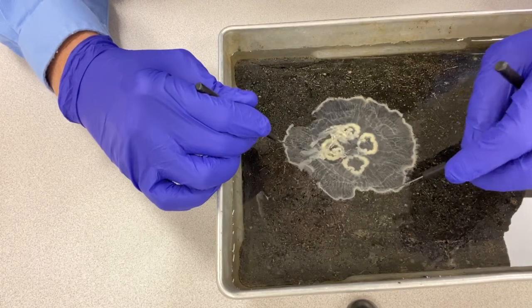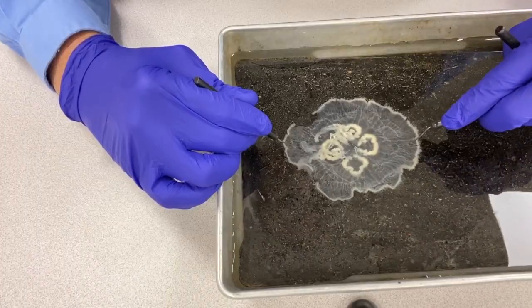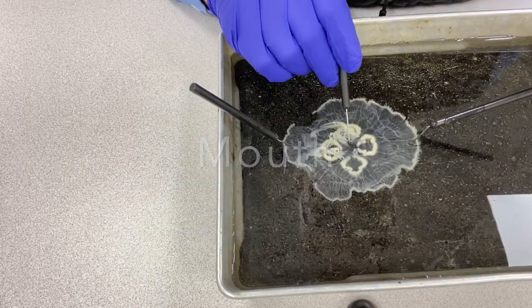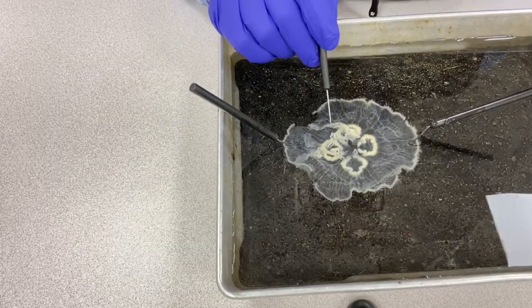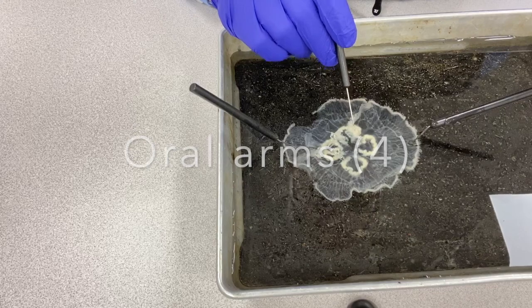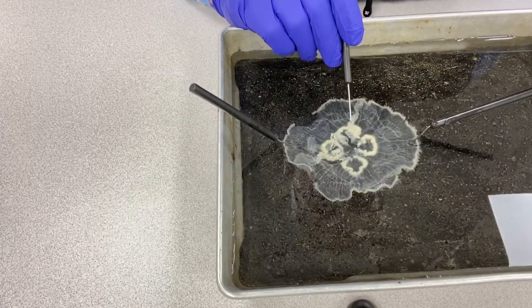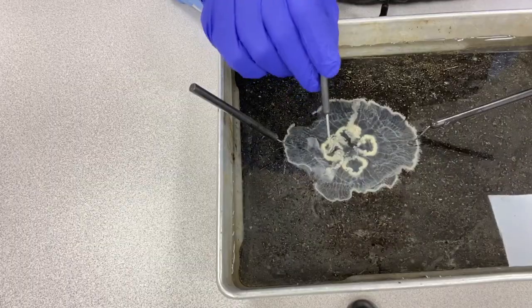I'm just going to put two probes in here to keep it from floating around too much. Now on the undersurface, if you look right in the center, there is an opening — that opening is the mouth. Coming off the edges or corners of the mouth are these long frilly structures. There are four of them and these are the oral arms, called the oral arm of the manubrium in the lab manual. These are the structures that capture the food this animal lives on.